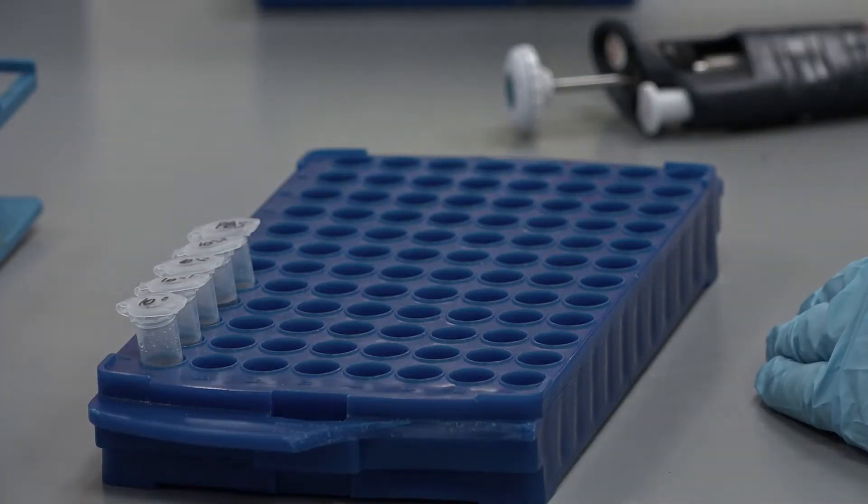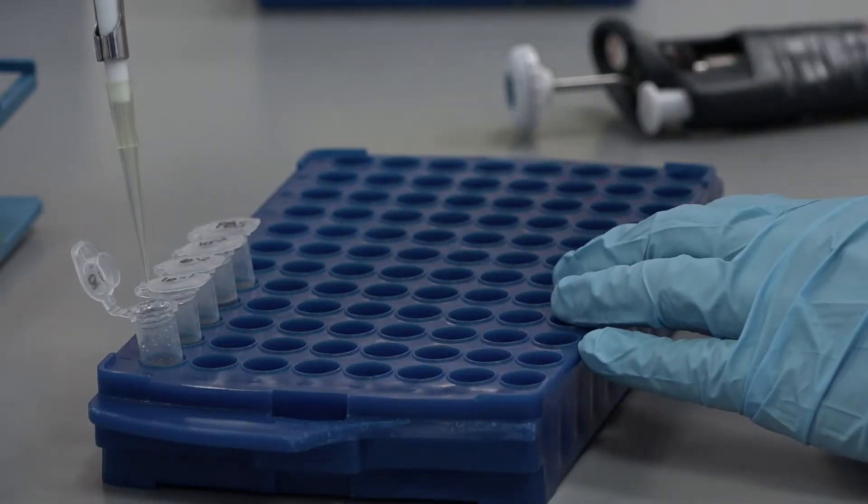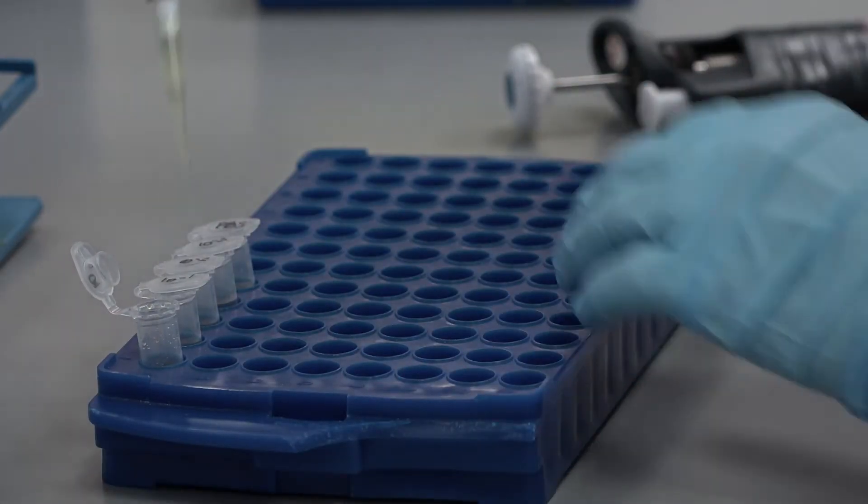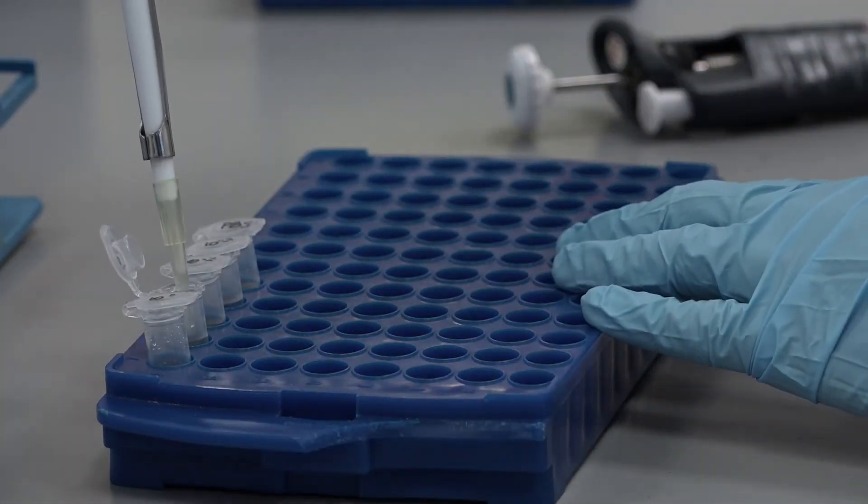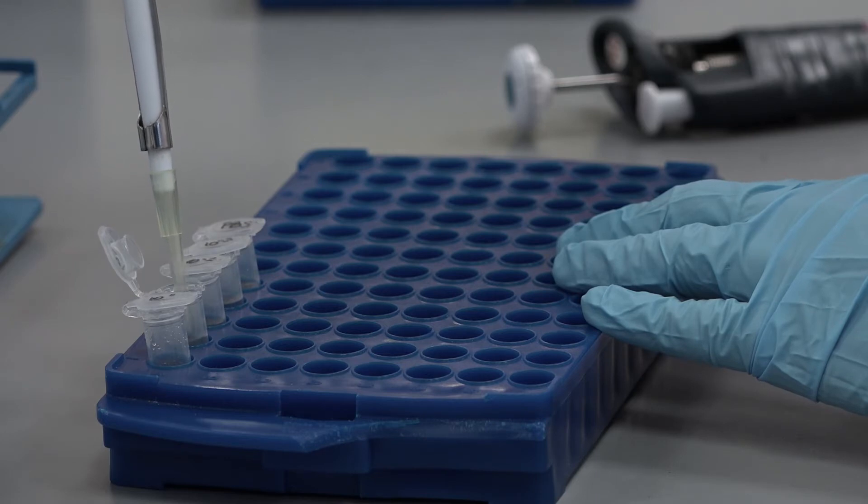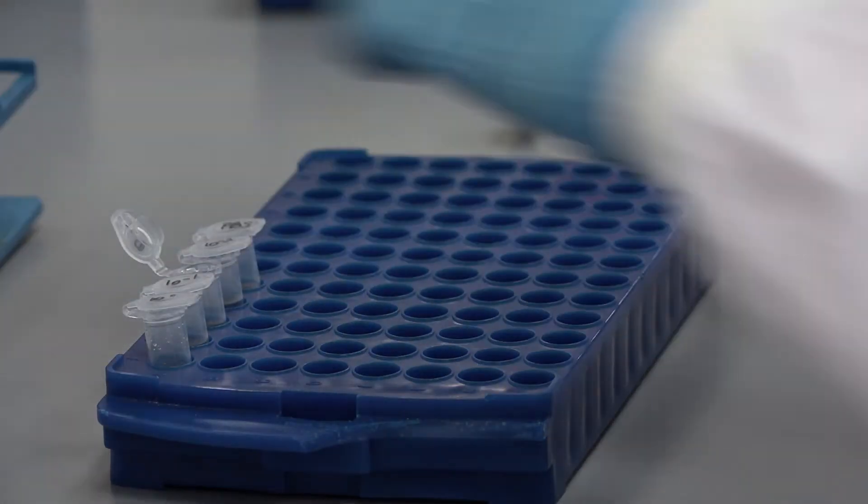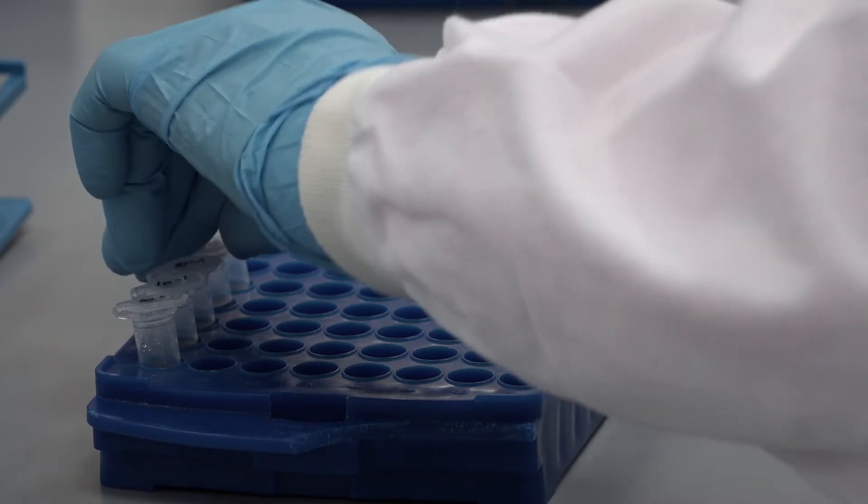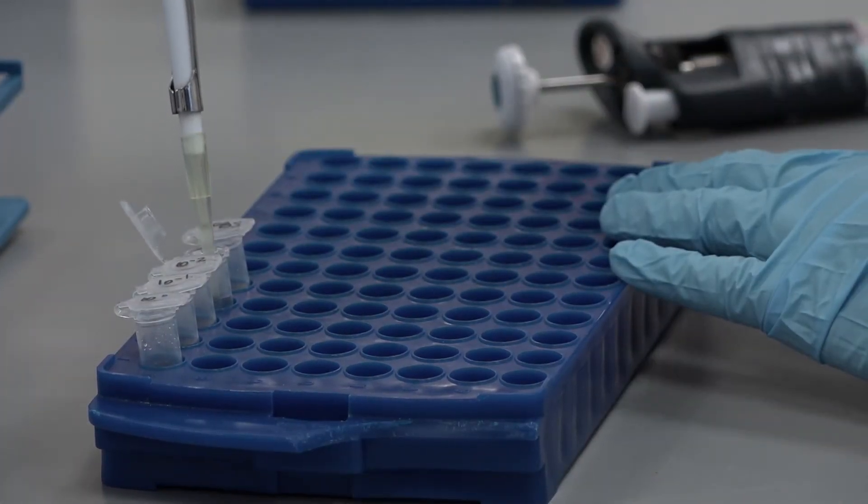Set up the dilution series in sterile Eppendorfs to a total volume of 1 mil with sterile PBS. 900 microliters of PBS mixed with 100 microliters of the overnight culture adjusted to an OD of 1 will give you the minus 1 dilution. 900 microliters of PBS mixed with 100 microliters of the minus 1 dilution will give you the minus 2 dilution. For the minus 3 dilution, take 900 microliters of sterile PBS and add 100 microliters of the minus 2 dilution.